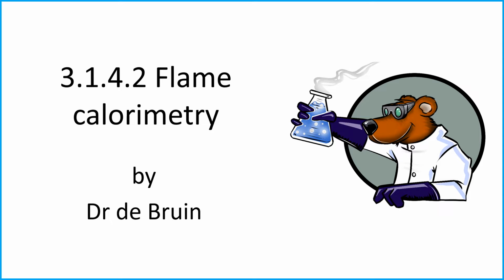This is a video about flame calorimetry, which comes up as part of the AQA A-level Chemistry topic of calorimetry. We'll look at both some practical considerations for doing flame calorimetry and also the calculations involved in using the data from that practical to calculate a value for standard enthalpy of combustion.